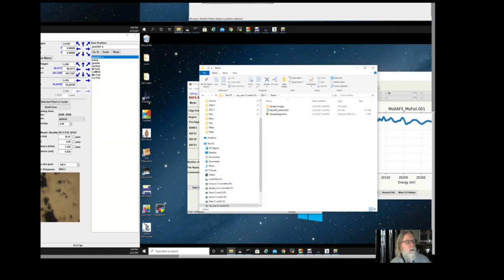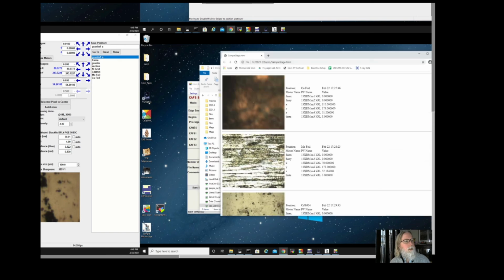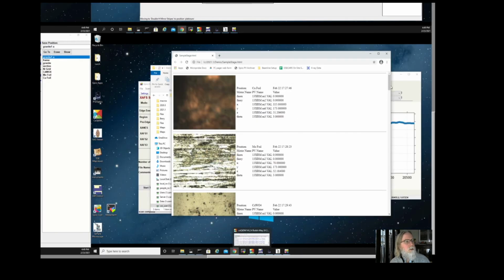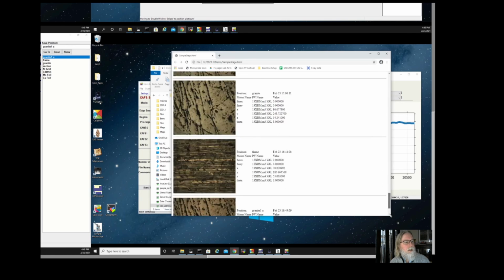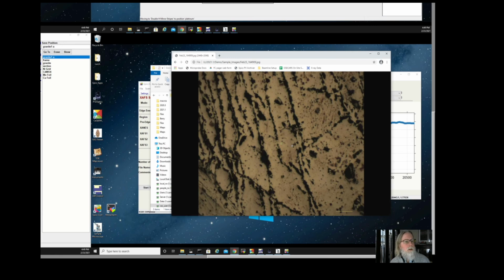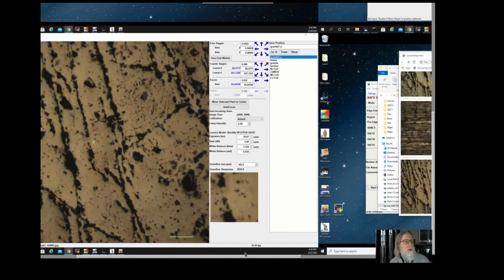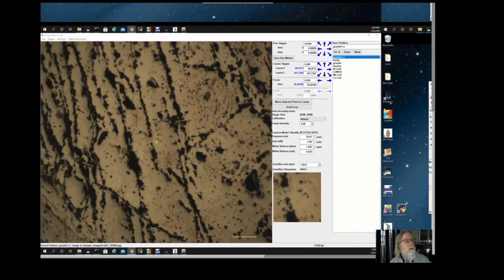And if I go here, there's sample images and a sample stage.html file. If I click on that web page, this will show all of the positions that we've saved in order. So here at the bottom is the last image I saved, and that's the image that's in your folder that goes home with you in your set, and also has all of the positions for that, so that we can return to it even if disaster happens and we've lost all of the positions.